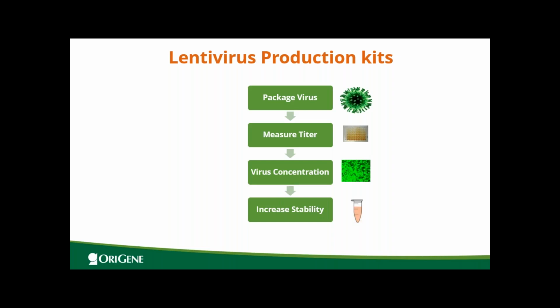Next is the stability issue. Lentivirus is known to lose infectivity during storage, even at -80. So you may need to increase the stability in the buffer.